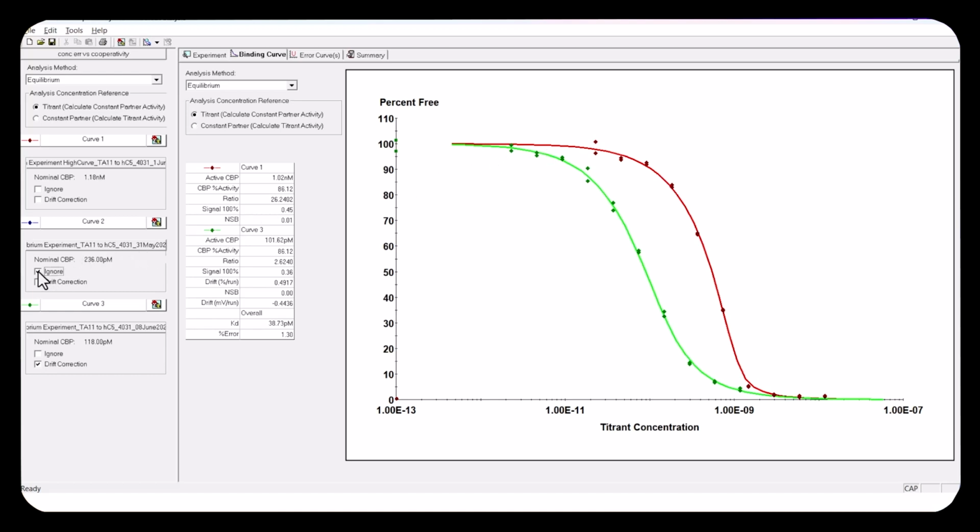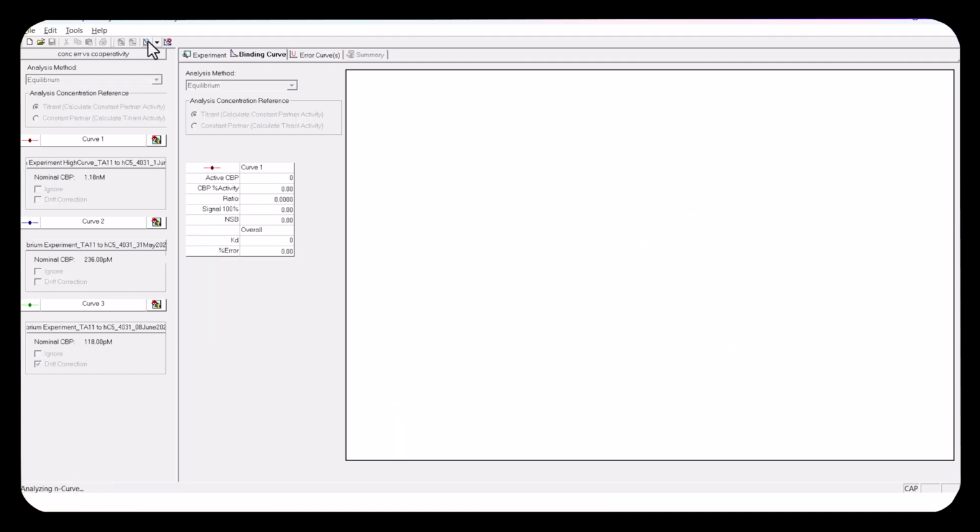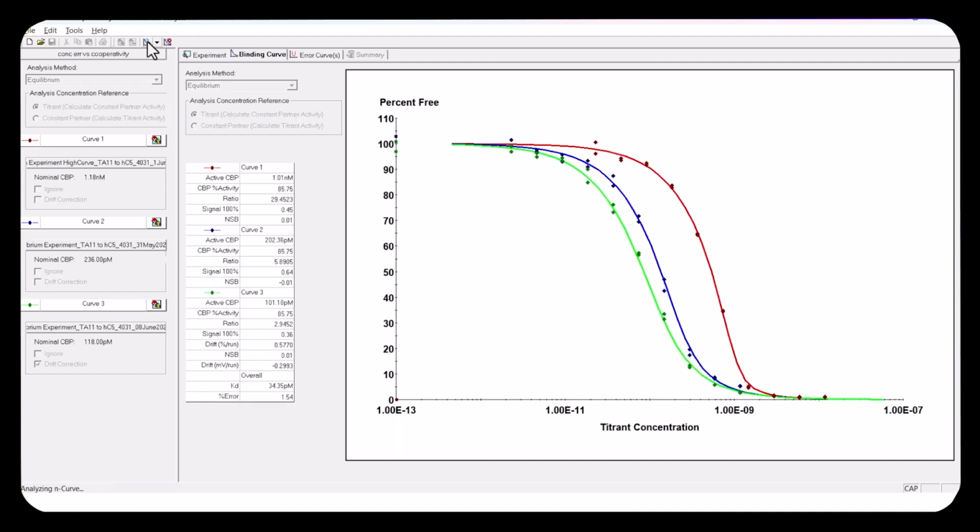Now, if I change the concentration on this, which I did, I haven't changed it back. And with that changed, I could put that curve on there and it should all fit, and it does. But I'm not going to report this curve because I don't have any documentation to support the change in concentration. I think that's what happened, but that's not enough for me to include this in a report or to publish it. So this data is left out. This data we're just not going to use. So I'm ignoring it here.